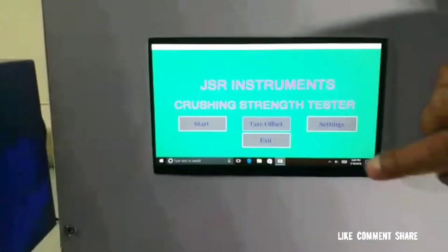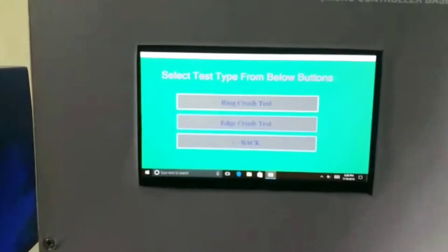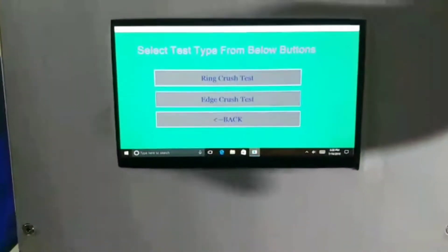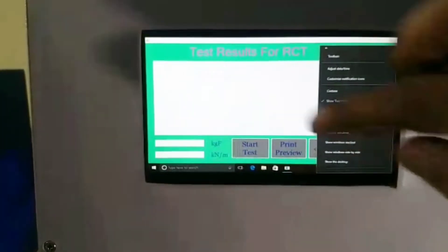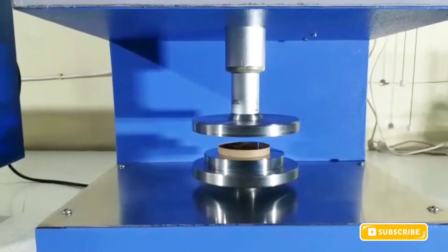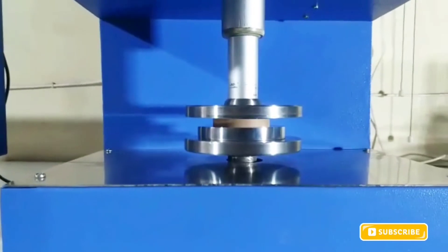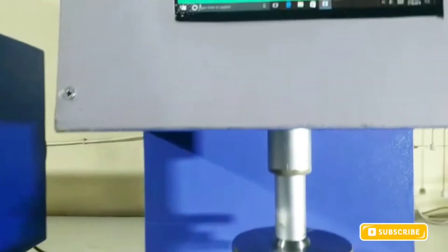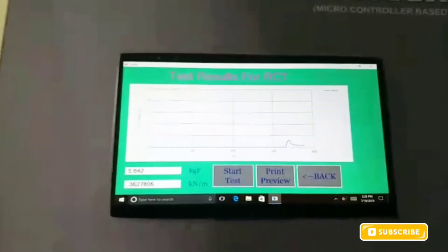We press return, and then we press start. If this is a ring crush test, then we press Ring Crush. Once the Ring Crush Test is pressed, we press Start Test. Once Start Test is pressed, the upper platform comes down to press this ring.